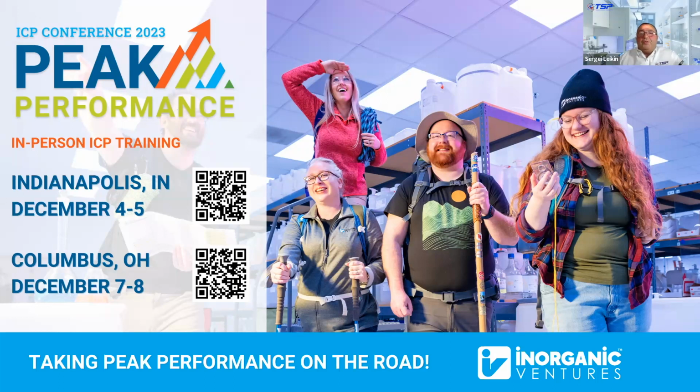Okay. All right. And then the next question, how often should pump tubing be changed? I would refer you to the very good, comprehensive advice from your instrument manufacturer. There is a maintenance schedule you should follow, but generally speaking, there are two types of tubing. One is where the sample goes, which is way more critical. If you're running 8 hours a day at least, that should be changed at least once every couple of days. And again, look at the physical health of your tubing. It should not have any flattened spots, and it should be stretchable. If those two things are present, you can put the tubing back on the instrument.